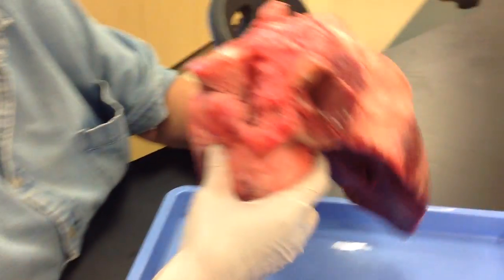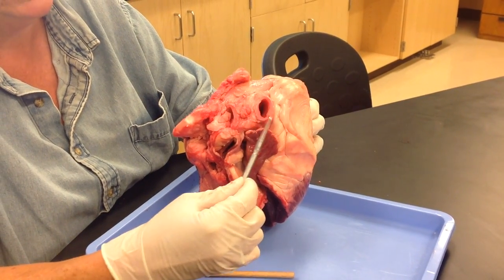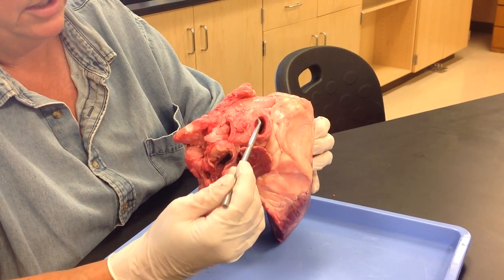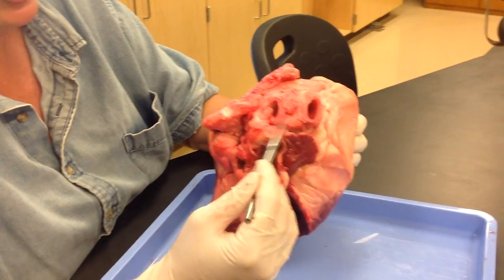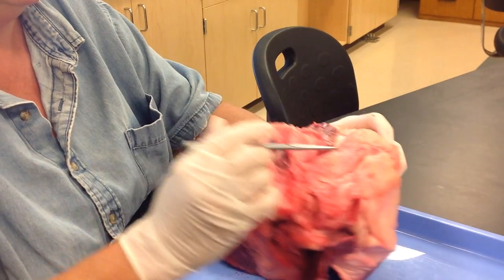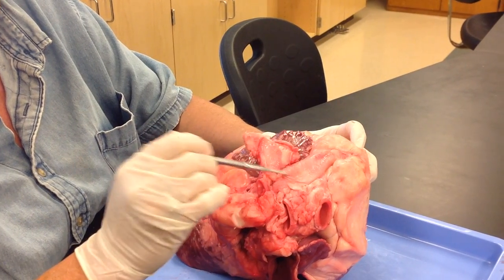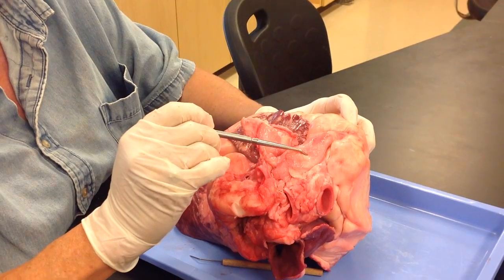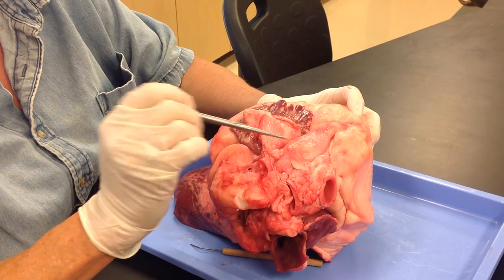When you're looking at the vessels on the base of the heart, anything that is very sturdy, like this, is an artery — very sturdy walls because of the high oxygen and pressure. This is part of the aortic arch. These are some of the branches off the aortic arch. Posterior to it is your pulmonary trunk — flabby, because it is deoxygenated. If I had a pin in the pulmonary trunk and said where was the blood before here, you'd say pulmonary semilunar valve. Where is the blood after it leaves here — pulmonary arteries.